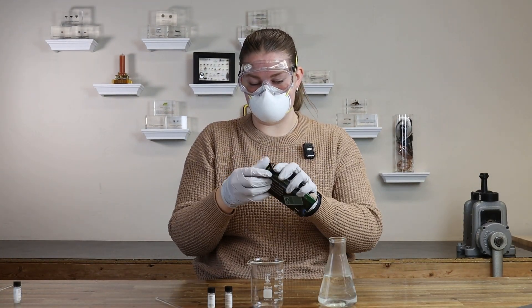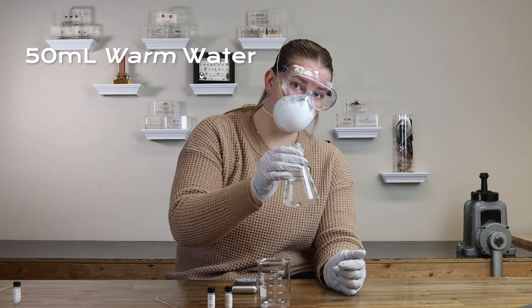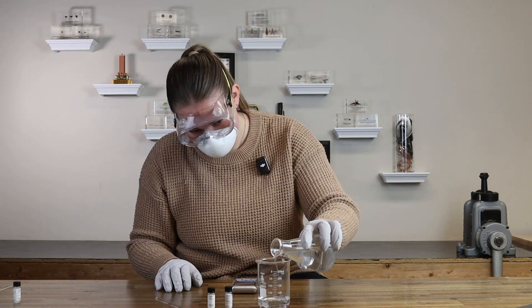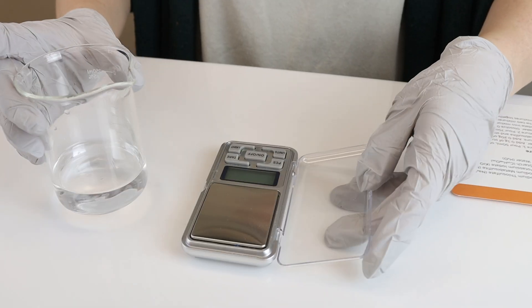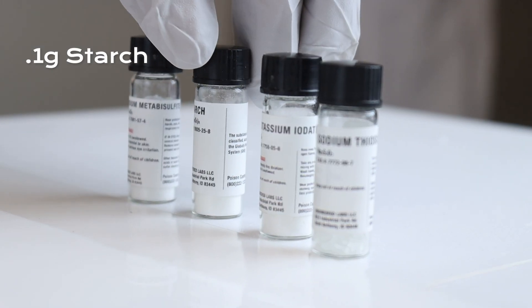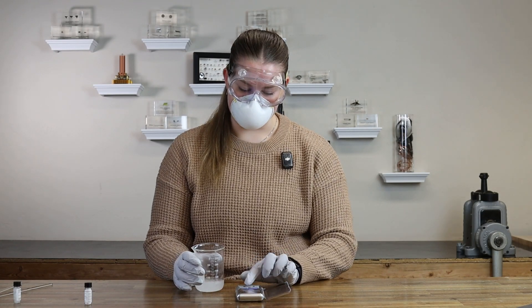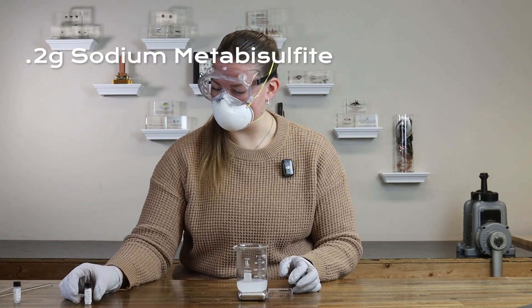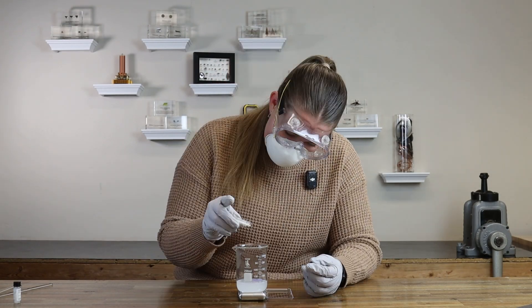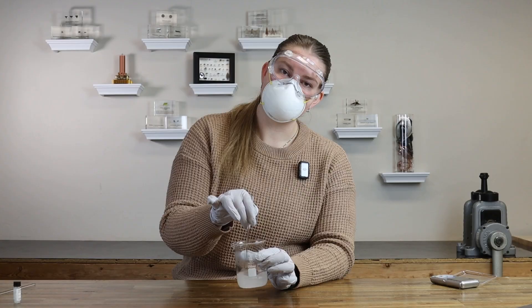I'm just going to go ahead and open up our pocket scale. We'll need it to measure out the starch and the sodium metabisulfite. Batteries are included. We're going to start with 50 milliliters of warm water. The temperature of the water will change the reaction in the end — the warm water does matter. I'm going to turn on our gram scale, go ahead and tare it, which basically just means set it to zero. And I'm going to do 0.1 grams of starch. Bringing the gram scale back in, we're going to do 0.2 grams of the sodium metabisulfite in solution A — 0.2 grams. Stir that up.